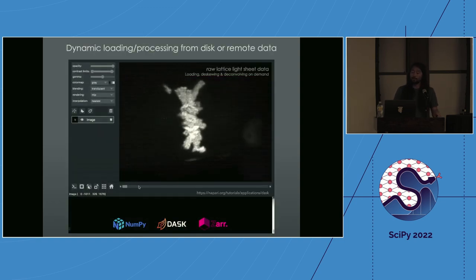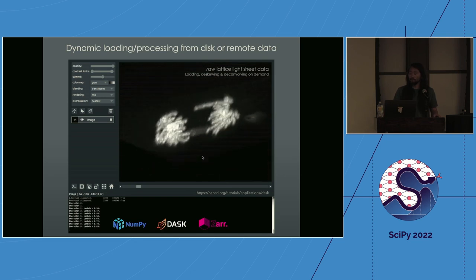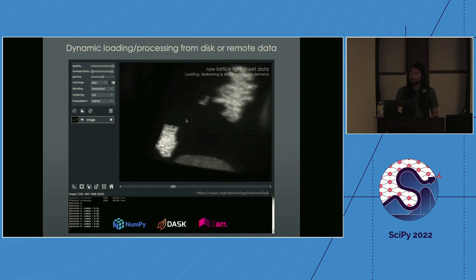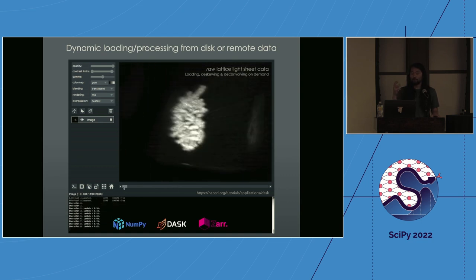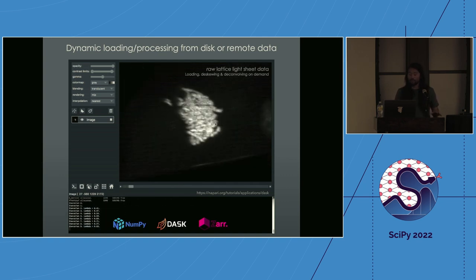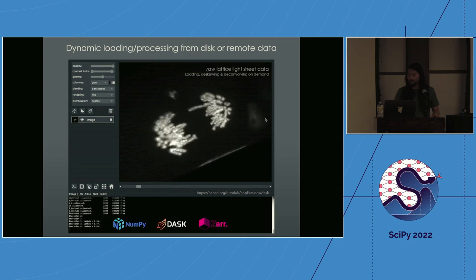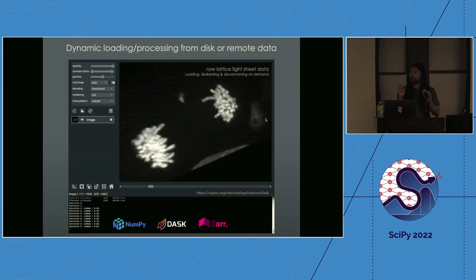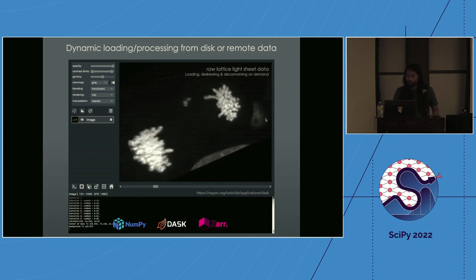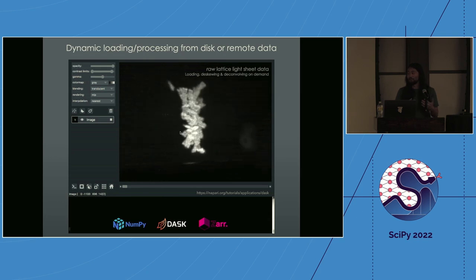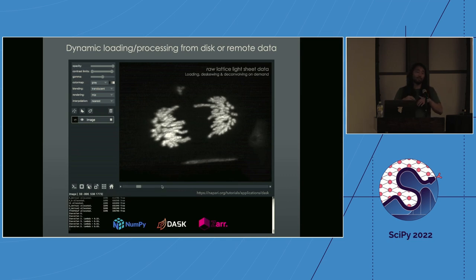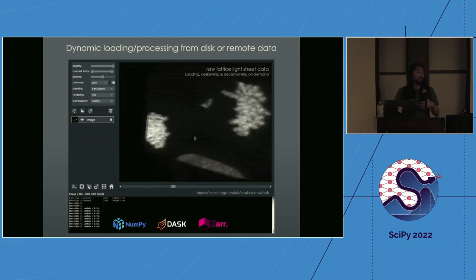We also allow dynamic loading and processing from disk — great for really large data. The jargon here is lazy loading: you only load the piece of the dataset you're currently viewing. This is an example from Talley Lambert, loading images from a microscope and doing quite a lot of preprocessing on the fly — deconvolving and deskewing the image to undo aberrations introduced by the imaging system.